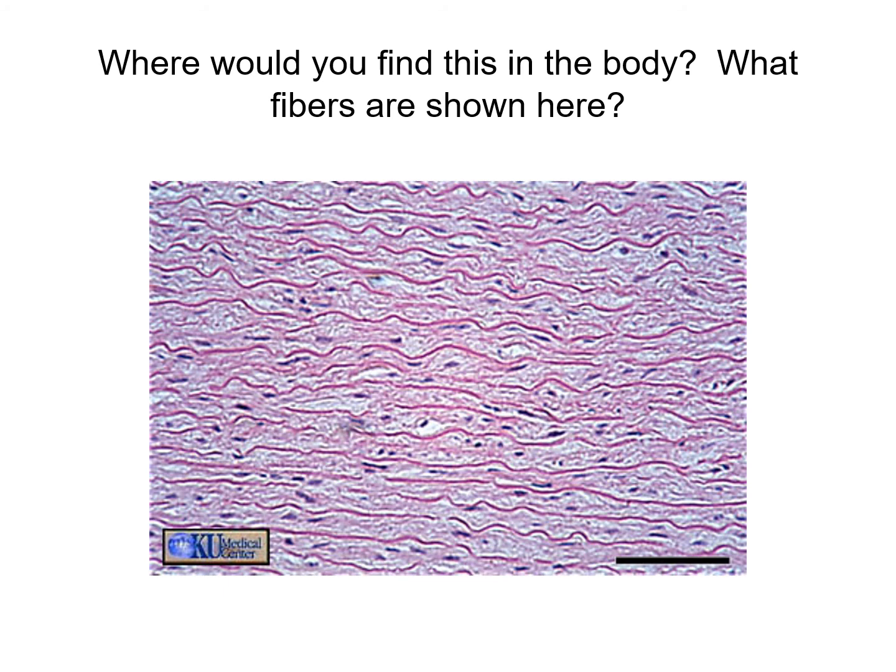I don't know. It's been a while. Is that ground? What is it? Ground substance? No. Hold on.